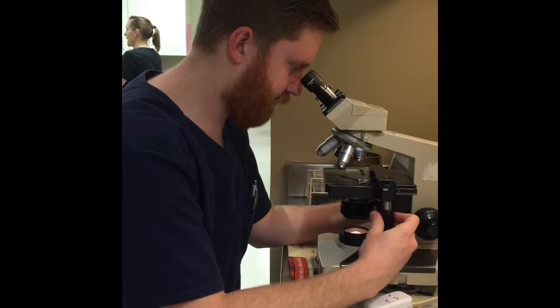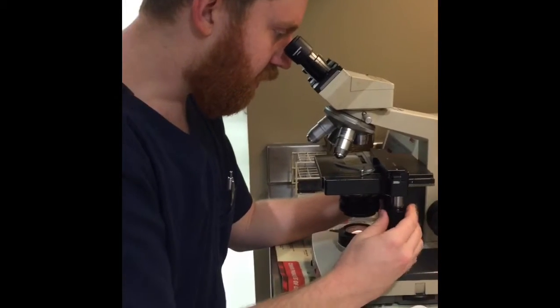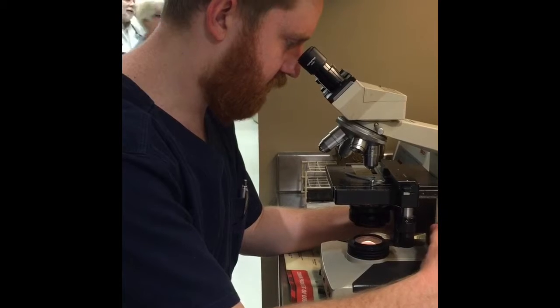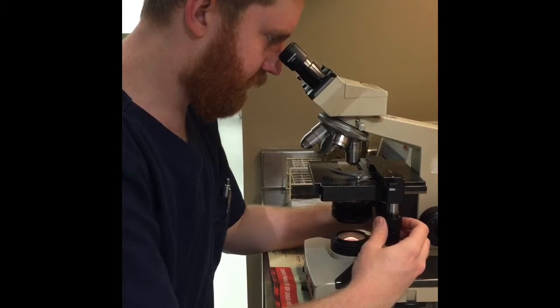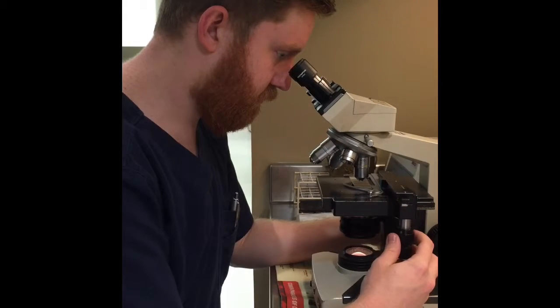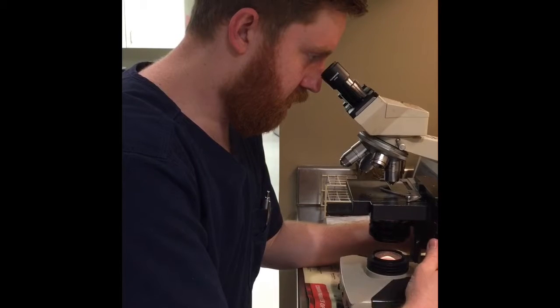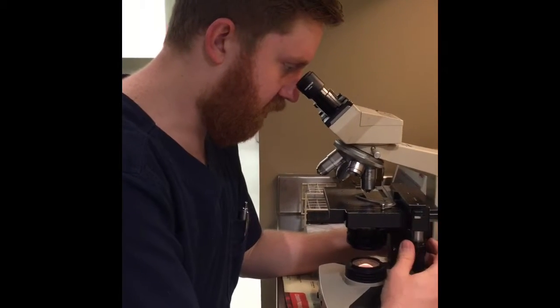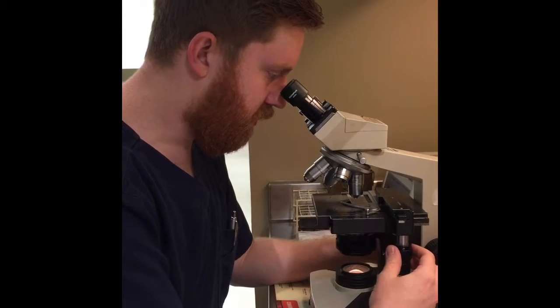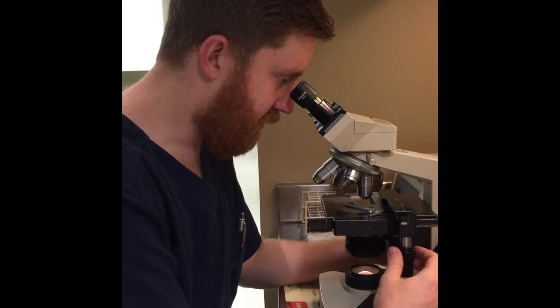Getting it focused here. So get my light levels right, since it is urine. Alright. So I'm just going to look through the entire slide here and see if we have any action, essentially. So far, there's nothing jumping out at me. It's just a lot of artifacts, a lot of debris. I'm not really expecting to see any crystals or cast, and hopefully I won't, but I'm going to take a look at the entirety of the slide.